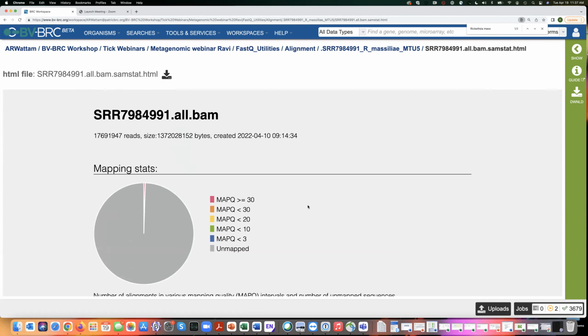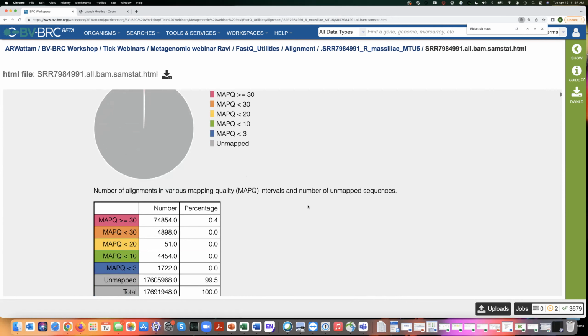So there's a question from Tomaskin Samuel. He's asking, how sure can you be that Staph didn't belong there? Oh, because I tried to map the reads to it. It didn't map to anything. So I tried to drag everything out from it. So that's why I'm convinced it wasn't there. Because I tried mapping to Staph itself and I couldn't find them. Okay, good. That's how I feel convinced of it.